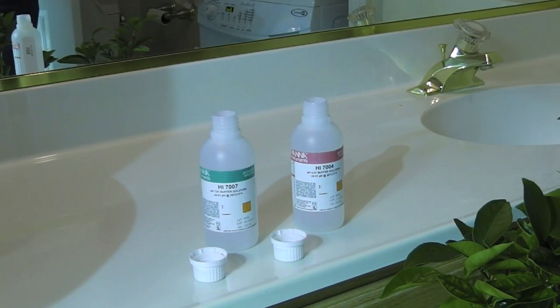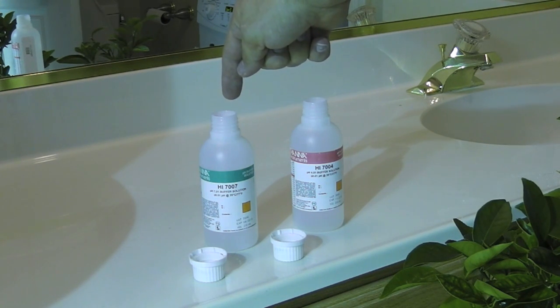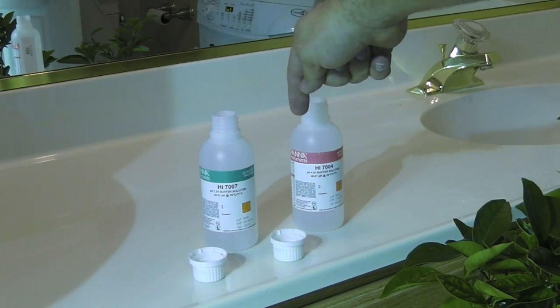I want to test the pH to make sure that my pH meter is accurate, so I'm going to stick it in first a 7.0 buffer and then I'm going to calibrate it and stick it over in the 4.0 buffer and calibrate it again. So here we go.